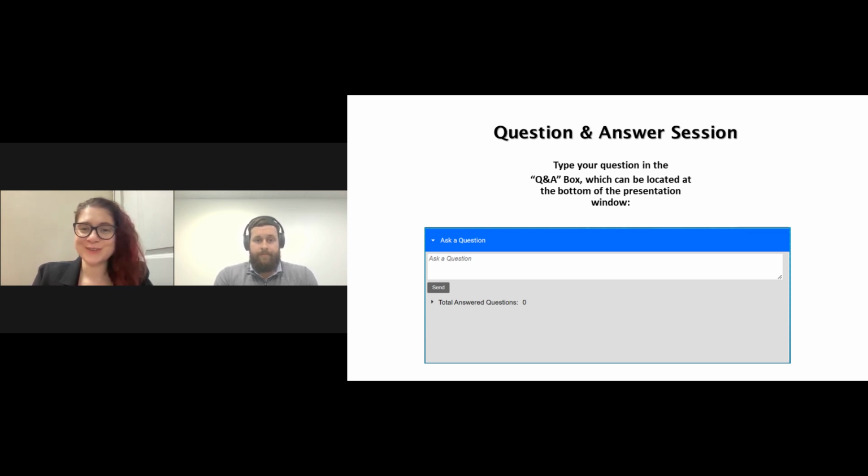Great. We have a lot of people very interested in this, and more questions keep coming in. The next one says, how many detectors can be simultaneously installed in the new GC-2050? Currently the Brevis GC-2050 has the ability to install 3 detectors. Although the oven size is quite small, we do have the temperature and flow zones for 2 inlets and 3 detectors. Now, I do want to put a little asterisk on that because it depends on the detector itself. For the Shimadzu TCD, that typically takes up 2 detector spots. So in those configurations, you may have 1 TCD and 1 FID, but we do have available locations for upwards of 3 detectors.